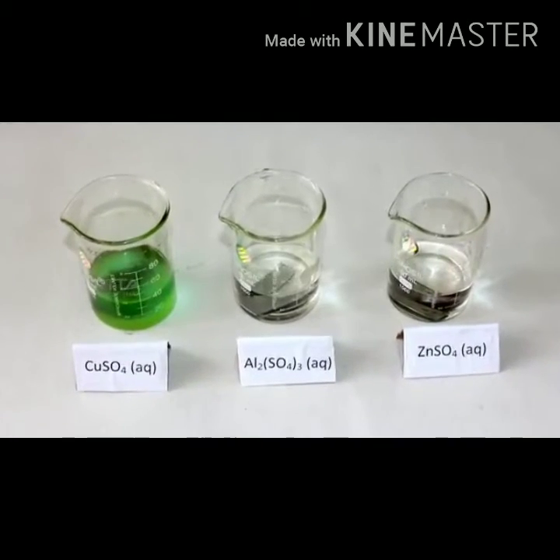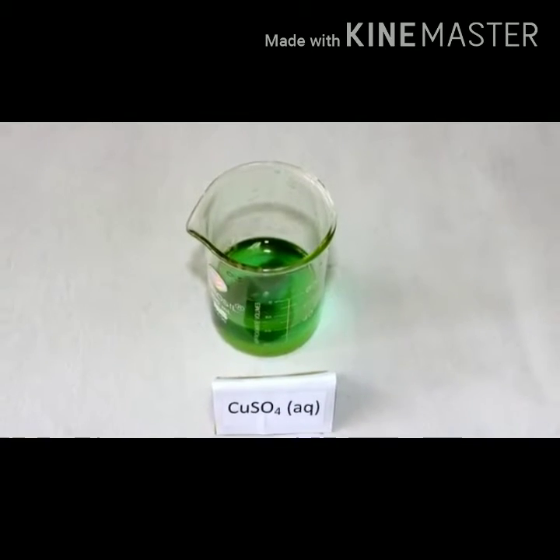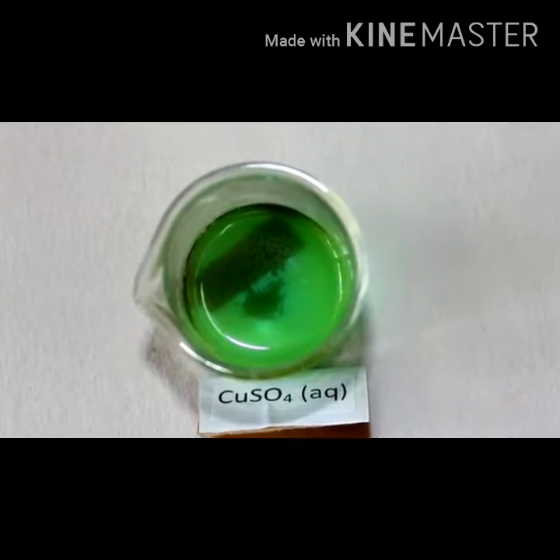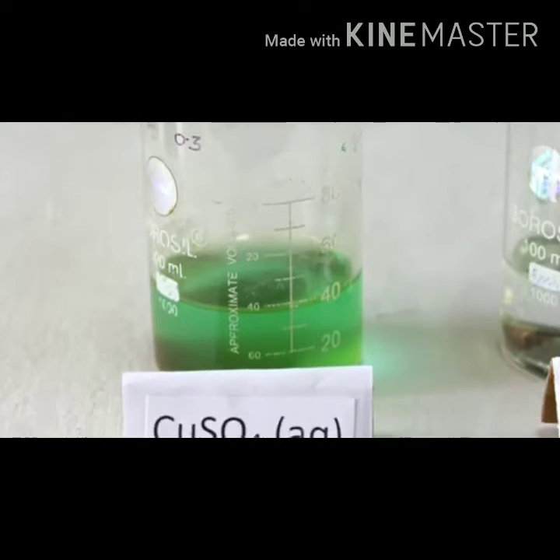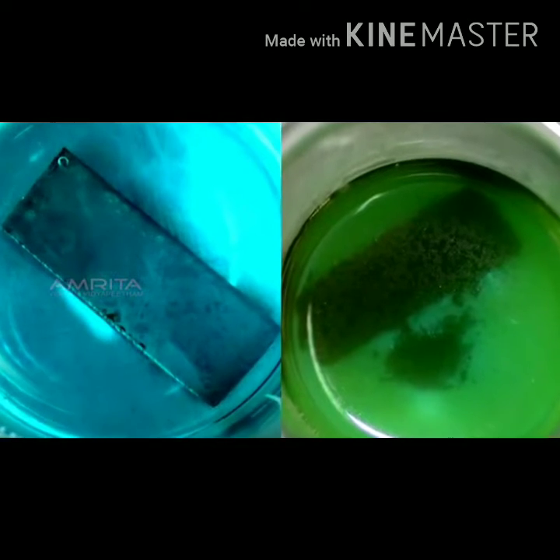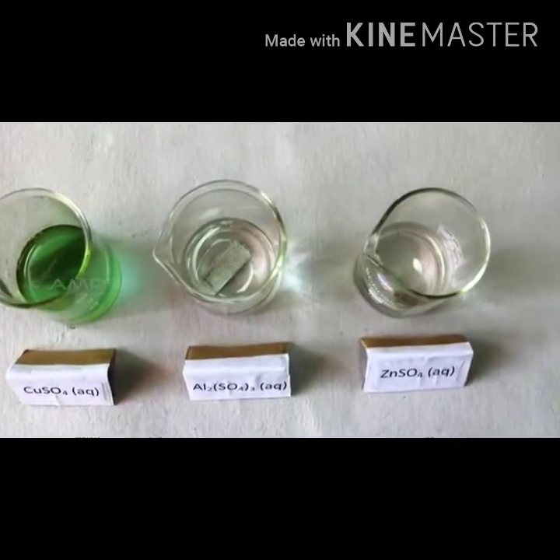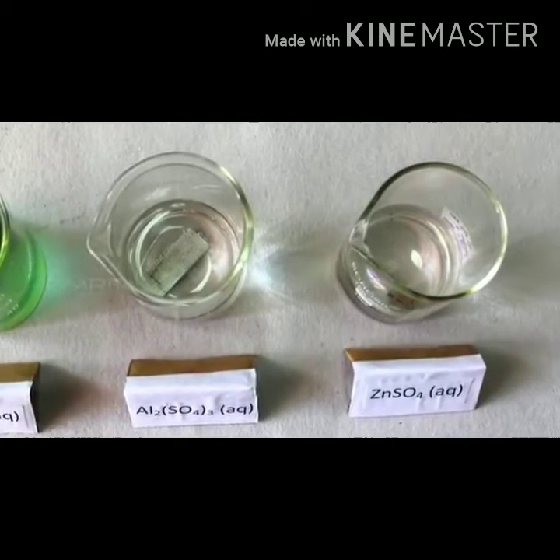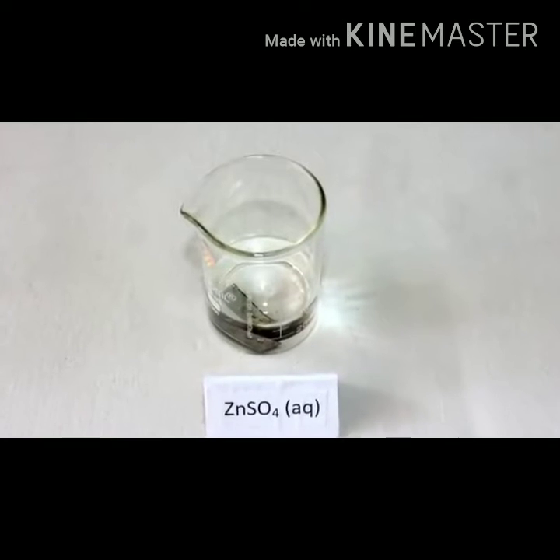After a day, the color of copper sulfate solution turns from blue to light green and red-brown particles of copper settle at the bottom of the beaker. This indicates that iron is more reactive than copper, as Fe2+ ions displace Cu2+ ions from copper sulfate solution. In the other two cases, there is no change observed. This indicates that iron is less reactive than the other two metals, aluminium and zinc, so it cannot displace these metals from their salt solutions.